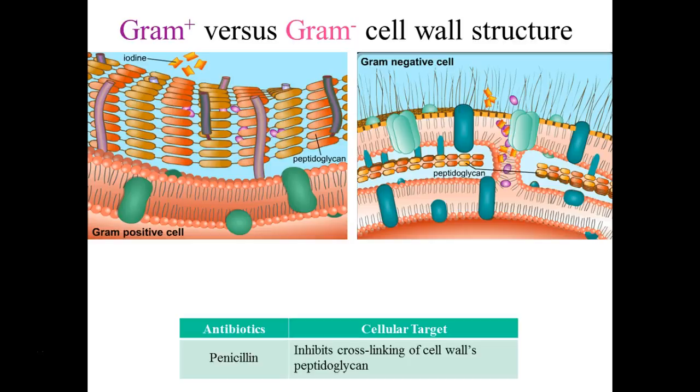So we saw something interesting today, didn't we? Penicillin didn't kill one of these guys, right? We specifically use staph because it's gram, anyone know? Positive. And we used E. coli because it's gram negative. E. coli is naturally resistant to penicillin. As you saw, it didn't get affected by the penicillin at all.